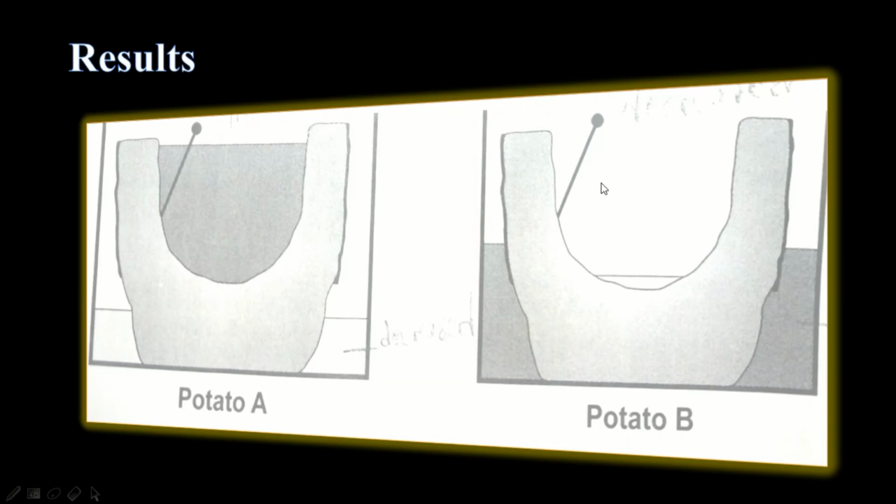Your water level in the potato decreased. How do we know? It's because the water is now below the pin. So where your pin is, this was the initial level of your water. And then we can see that after 2 hours, your water level actually decreased to that. Whereas in our beaker, our salt solution level actually increased. Now, this is what happens in terms of osmosis.